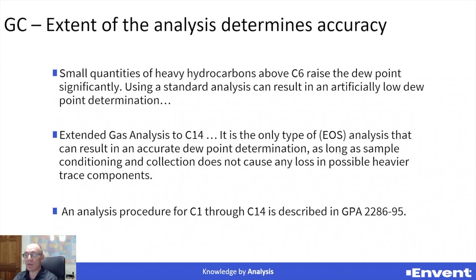speciation to achieve. Now, as I mentioned, that can be done in a remote lab through a sample, but please bear in mind that the issues with sample grab, sample consistency, the integrity of the sample through transportation, and through the analysis from the bomb into the GC also play a part. There is nothing like a direct measurement to improve the integrity of measurement. Taking a sample always risks the introduction of contamination.